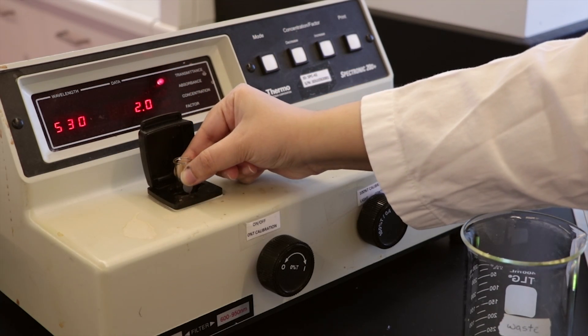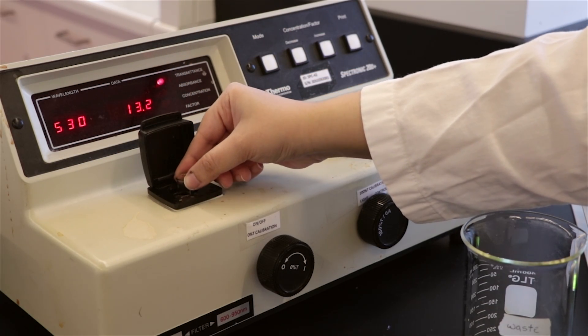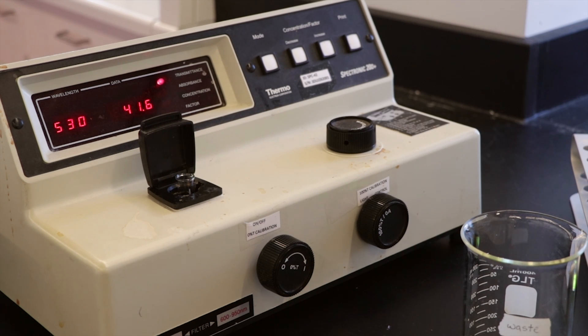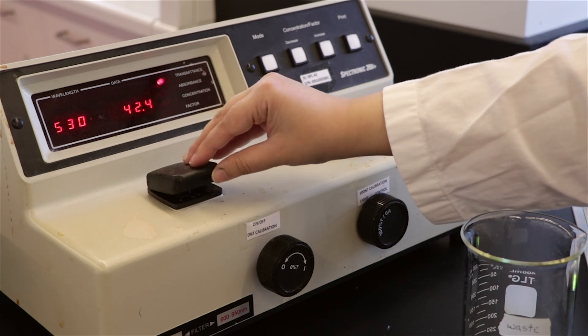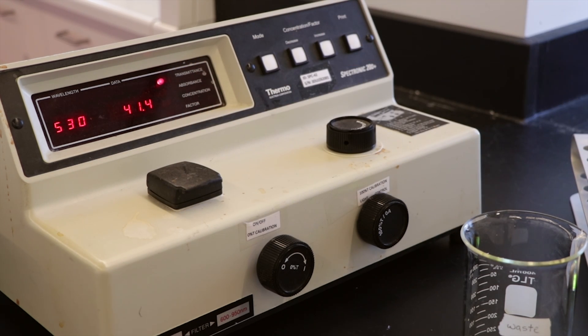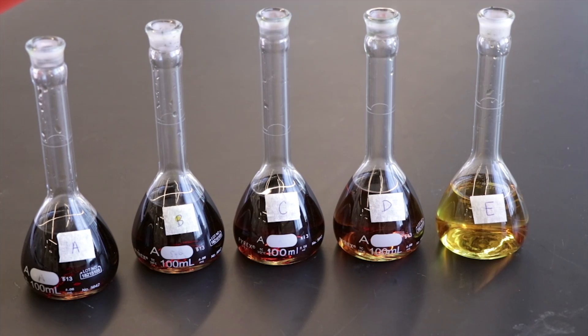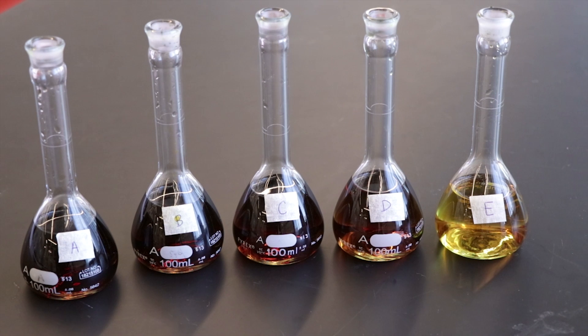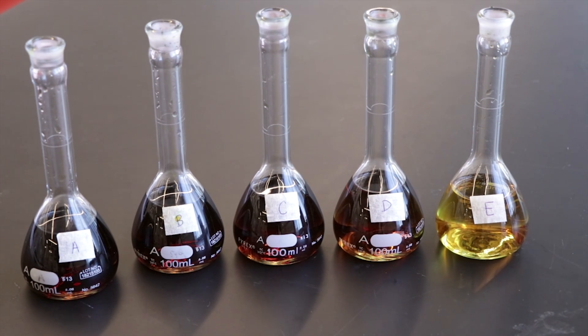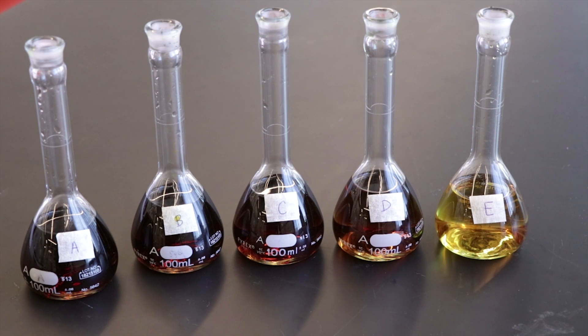To measure the percent transmittance of your standard solutions, rinse and fill the cuvette with the solution and place it in the holder. Close the lid and record the percent T-value displayed on the spec 20. Record the percent transmittance for all five standard solutions. You should analyze your standard solutions in a random order. Note the color gradient from flask A to E.